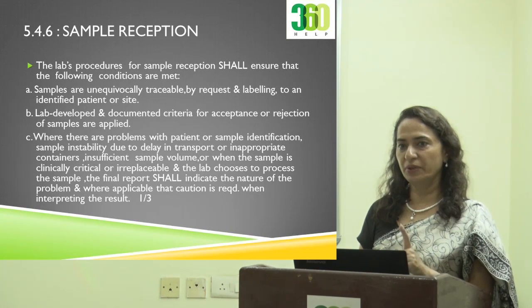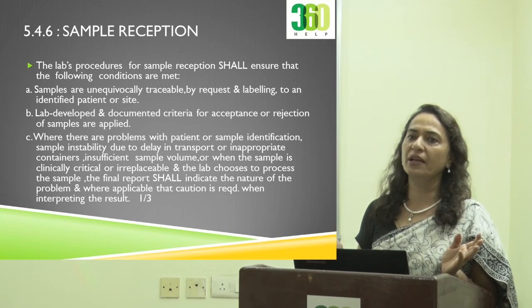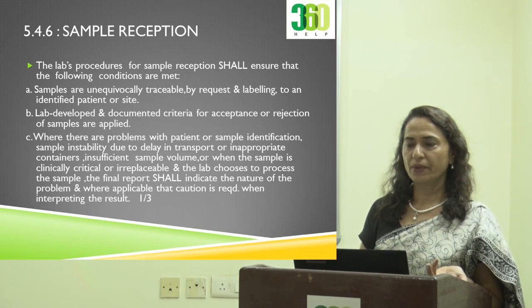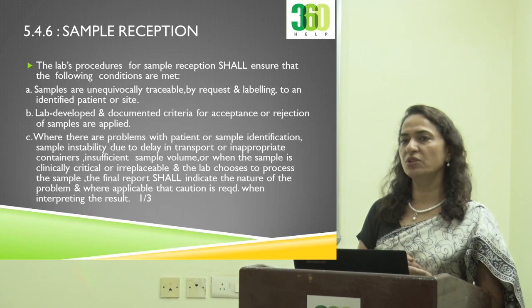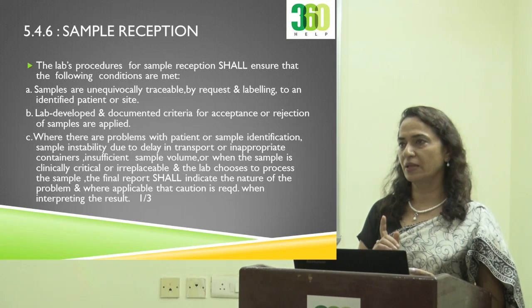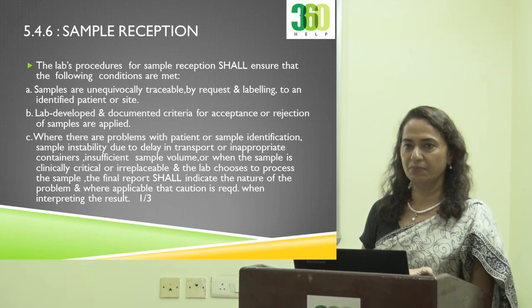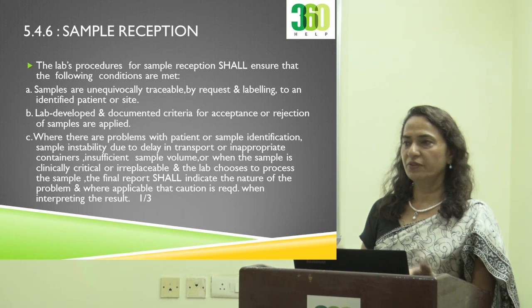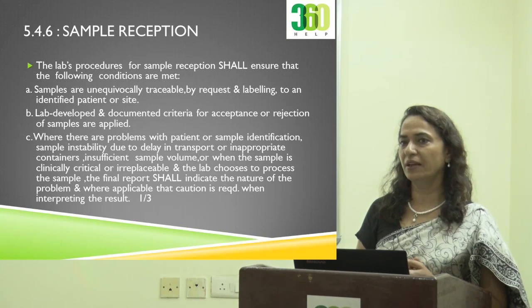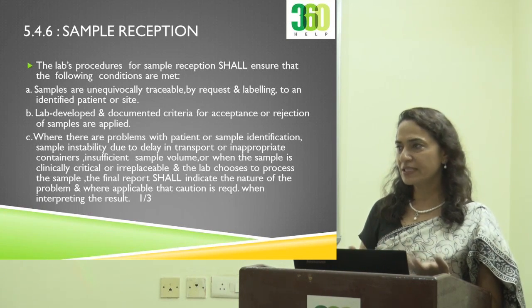but the process cannot be delayed. Maximum what will happen, if you have not been able to locate, your process will go waste. It's okay, no problem. For those samples which are precious, you can't stop the process. Same is with histopath. You have to start doing whatever is required because they are irreplaceable samples. If a uterus is removed, you can't take another sample, right? For blood it is fine. For all other materials which are replaceable, it's fine.